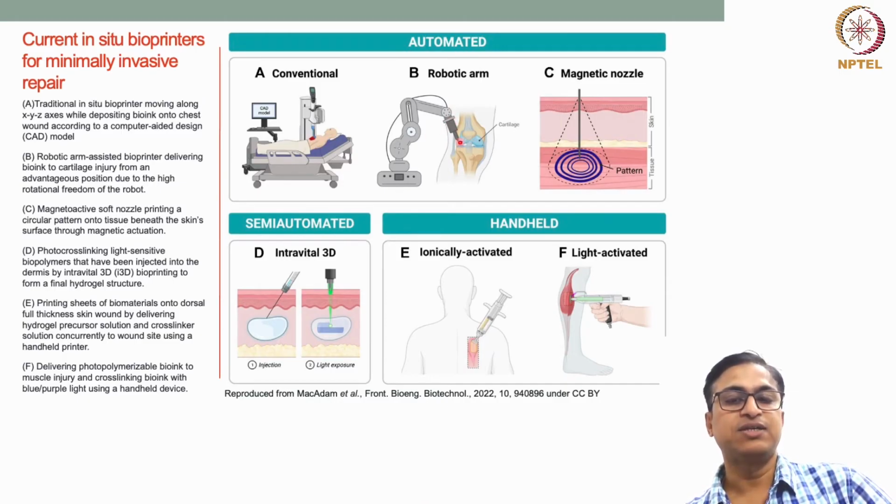Because of that rotational freedom, it can deposit the bioink in conditions where it is challenging to print directly.